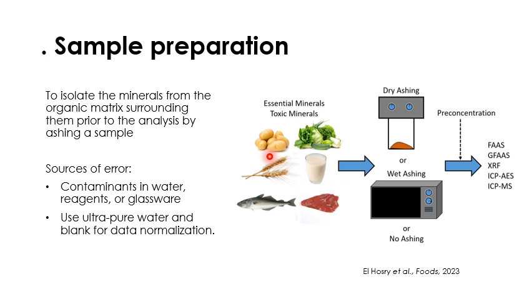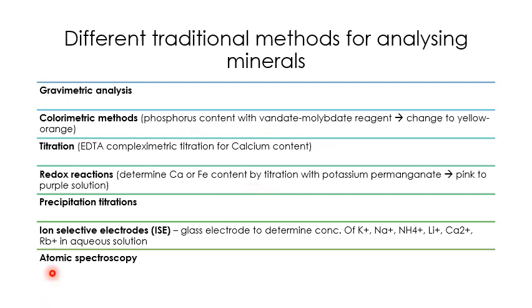One way you can overcome this error is by using ultra pure water and adding a blank for data normalization. There are different methods that we can use to analyze minerals, but I'm going to focus specifically on atomic spectroscopy.